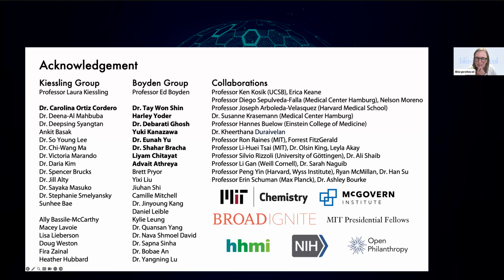All right. Can your technique be combined with other super resolution techniques or labeling strategies to further enhance the imaging capabilities? Yeah, I think it's definitely possible. Several groups in the world have already tried to combine expansion with other super resolution, and this gel is just a gel. So I think those improvements are definitely possible.